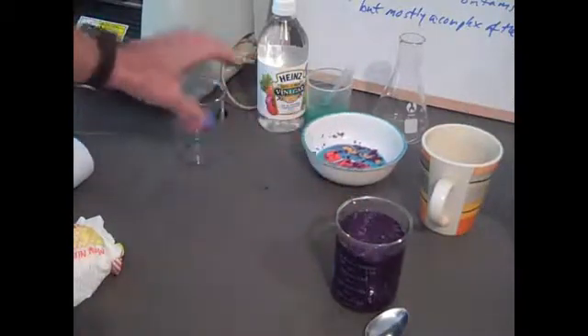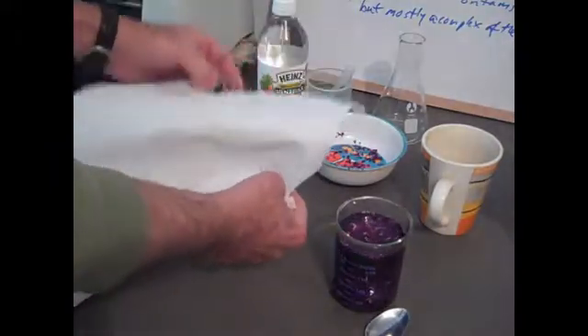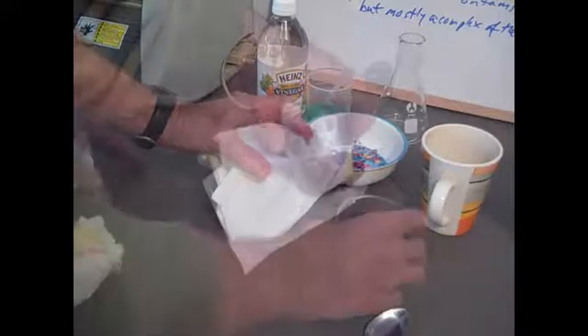We're going to try to transfer the indicator now to another beaker and filter out the residue — the red cabbage leaves — using a paper towel.